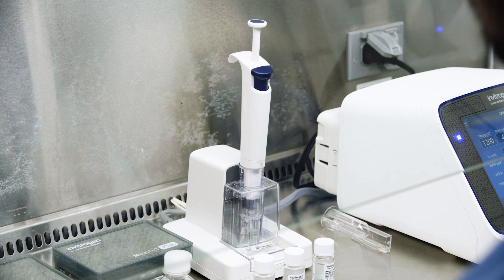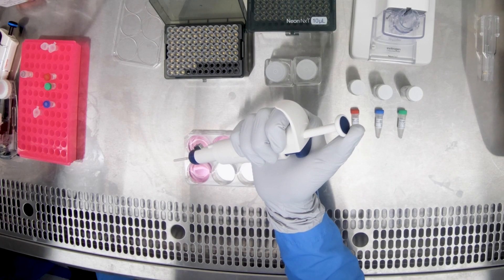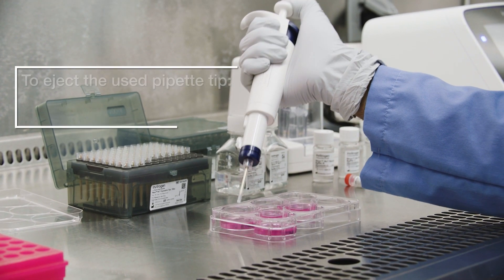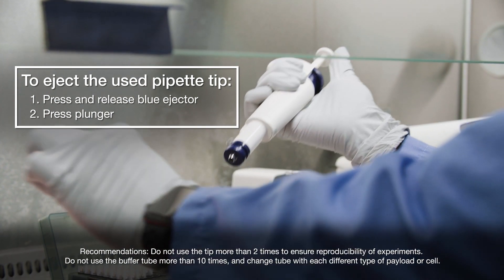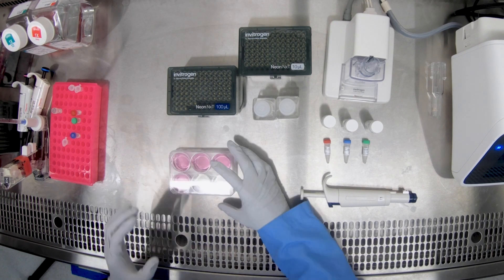Now you can undock the pipette from the docking station and dispense your transfected cells into the prepared tissue culture vessel. Eject the used tip by pressing and releasing the blue ejector, followed by pushing the plunger all the way down. Transfer the plate to the incubator, and you are now ready to transfect your next sample.